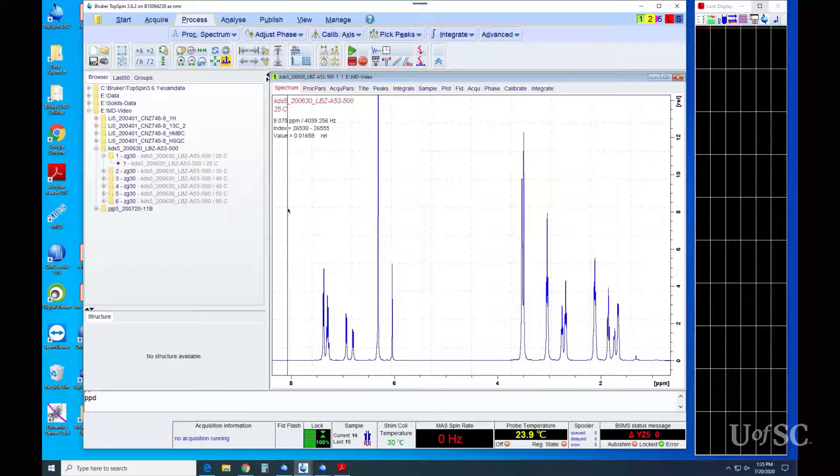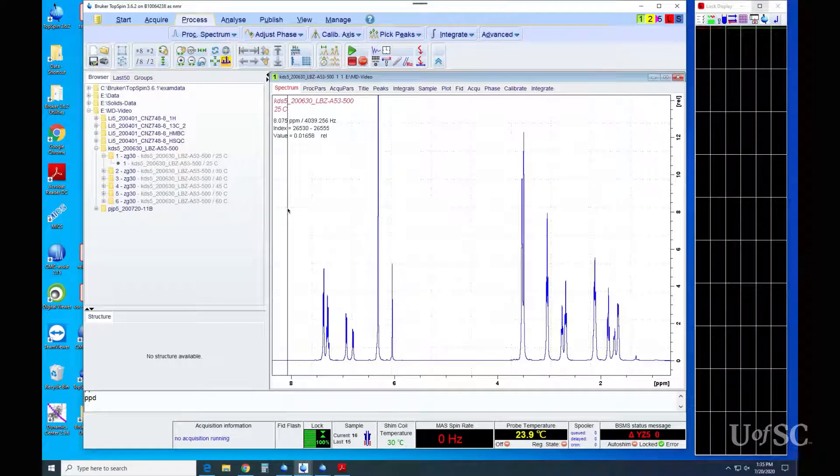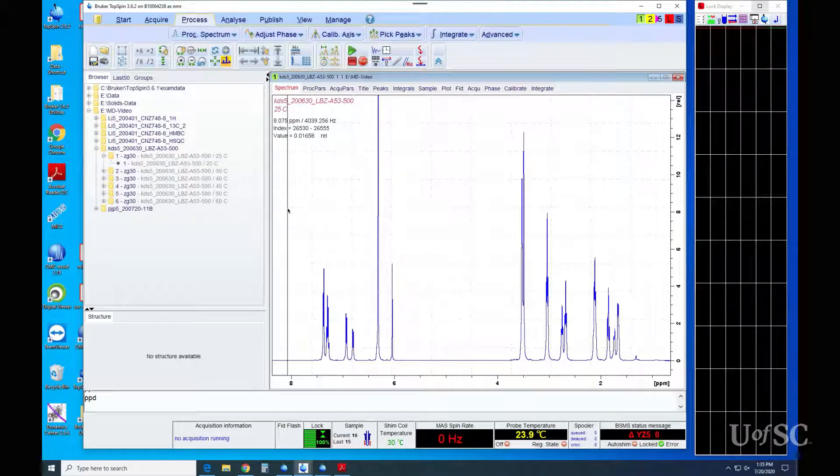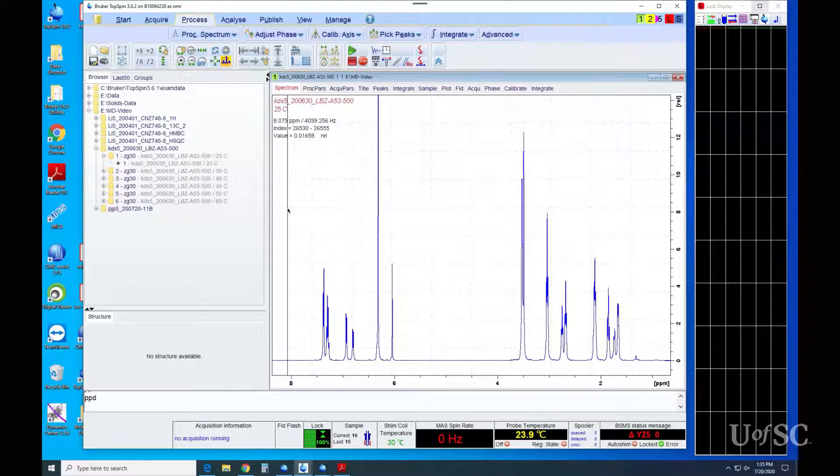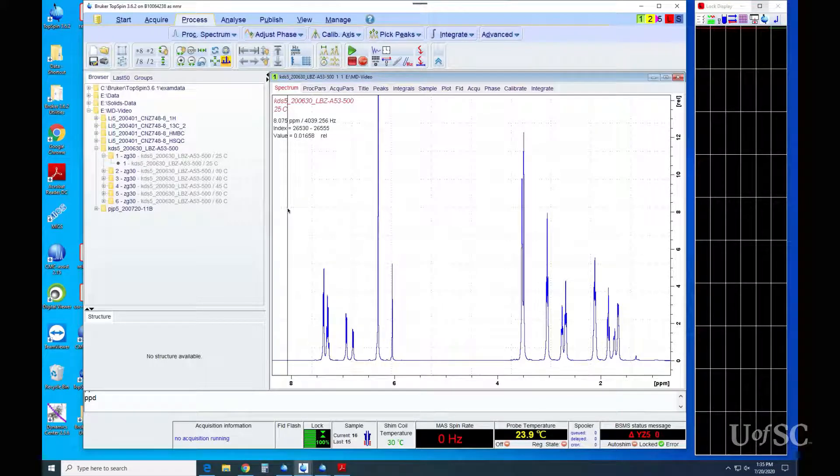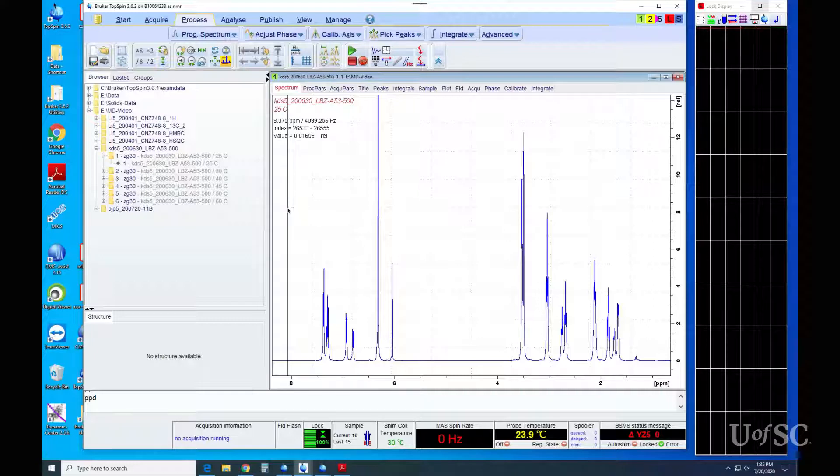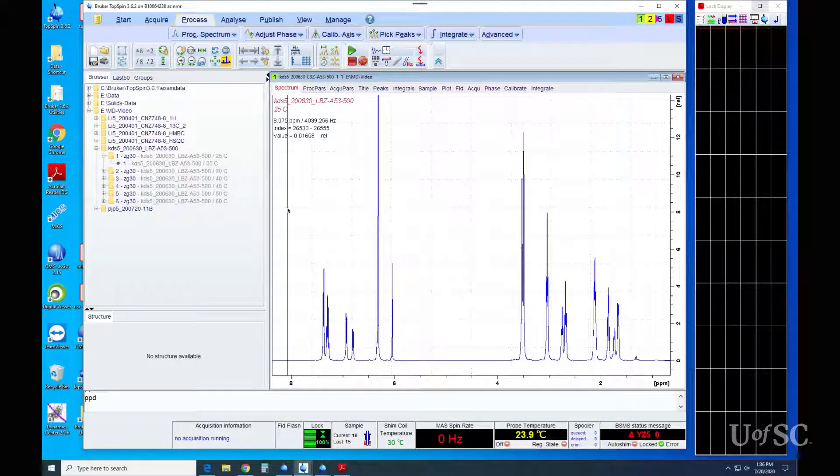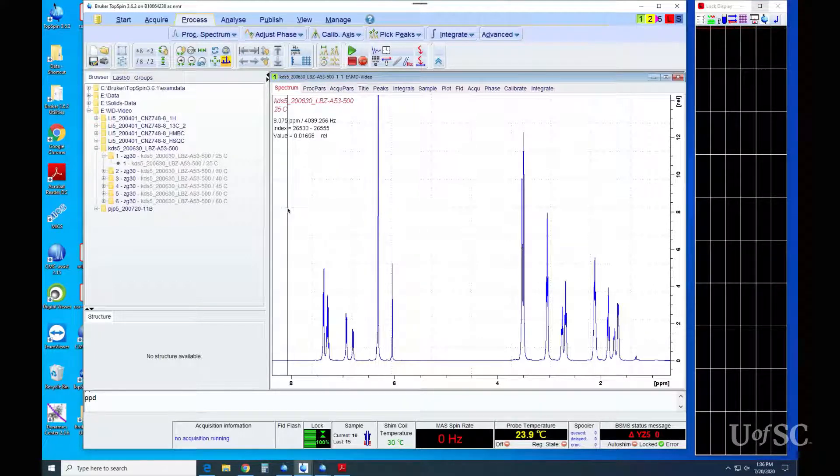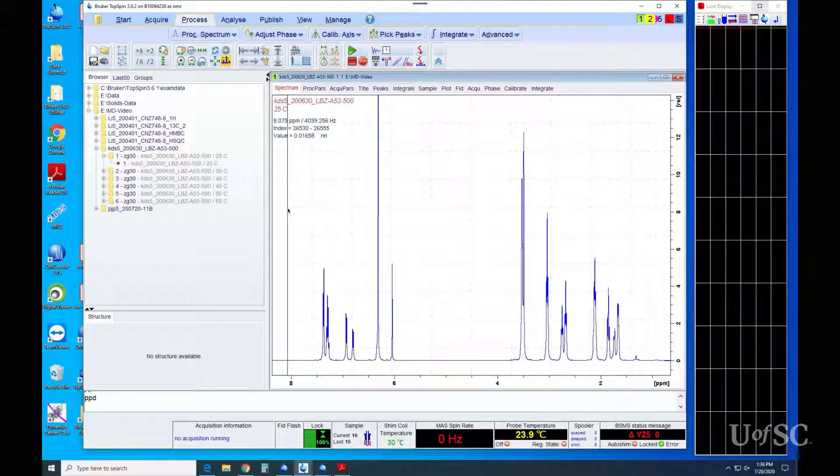Multi-display mode is the best way to compare spectra, monitor spectrum differences across experiments, and it can help with spectral interpretation. It is very useful for reviewing experiments that collect multiple spectra, like kinetics or variable temperature runs.